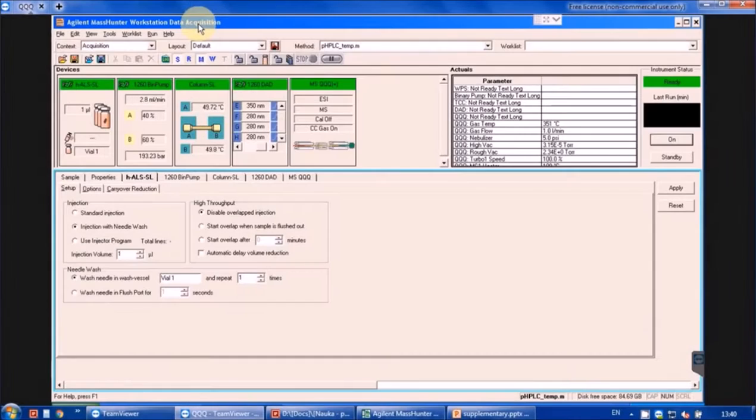The first step in development of a preparative method is optimization of the mobile phase gradient, in order to perform separations with good resolution, so that each compound is isolated as pure as possible and requires little additional workup, and within a reasonable amount of time, so that solvent consumption and time or workforce consumption are minimal and a large number of samples can be processed. Initial parameters are set from experience.